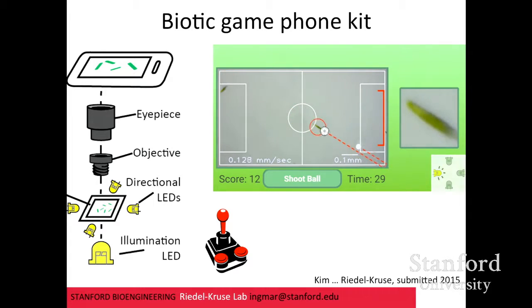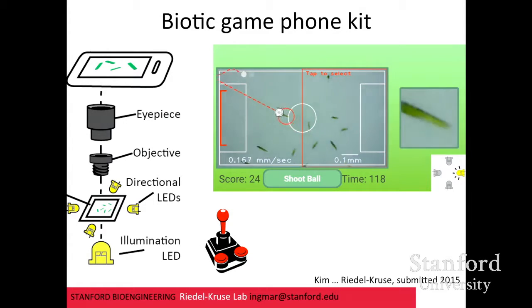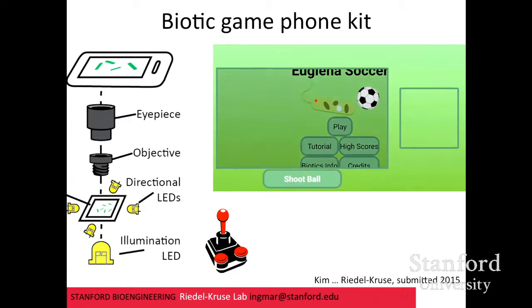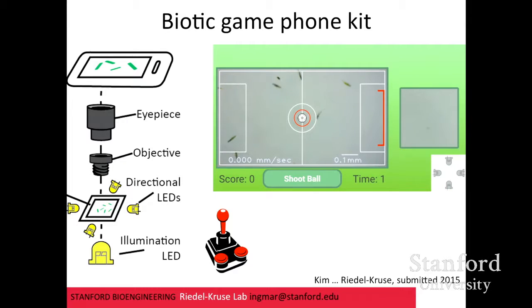So there's this playful aspect, but there's also the question: can we thereby emphasize something interesting and teach something about biology? And we can, because there's a scale bar here, right? You see something about size. You see the instantaneous velocity of the cell, which is currently tracked, right? You see how fast these cells move. You can also see something about the behavior in this close-up, right?